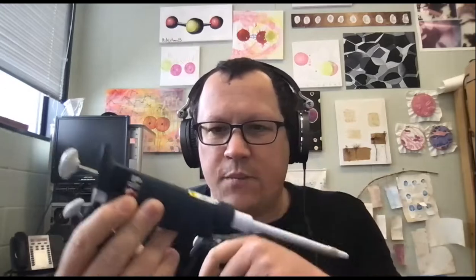Each type of pipette can do different sets of volumes. We have a P20, a P200, and a P1000. This one can measure up to 20 microliters. This one can measure up to 200 microliters. And this one can measure up to 1,000 microliters. We'll talk more about what microliters are in a second. The P20 and the P200 both use these tips like this. The P1000 uses different tips, and I don't have any of those right here with me.